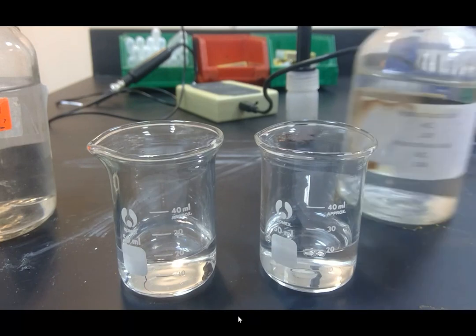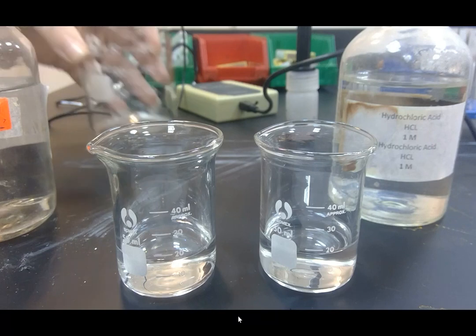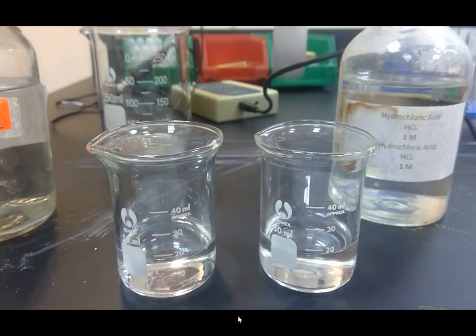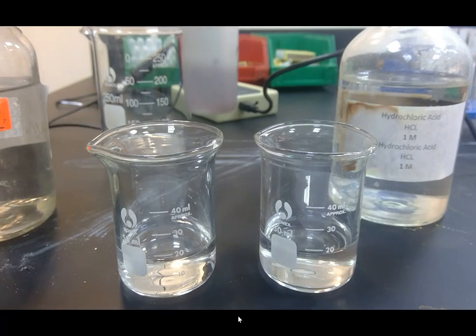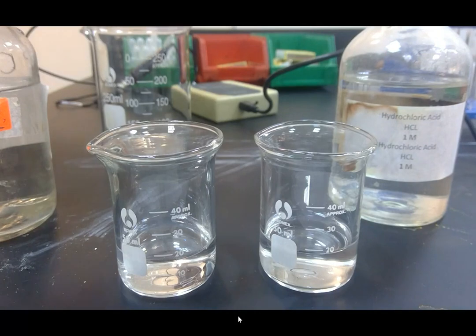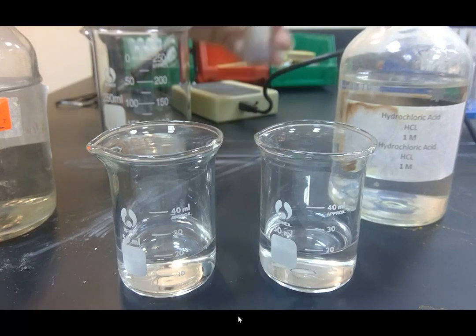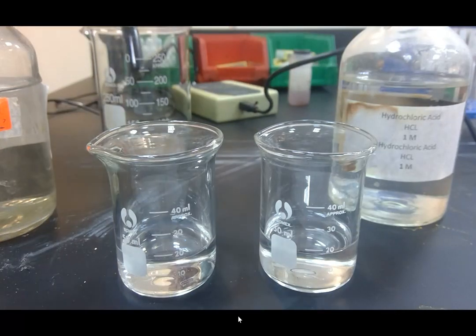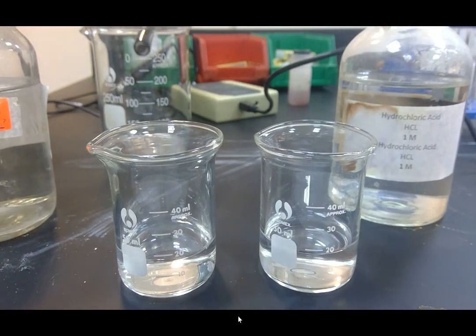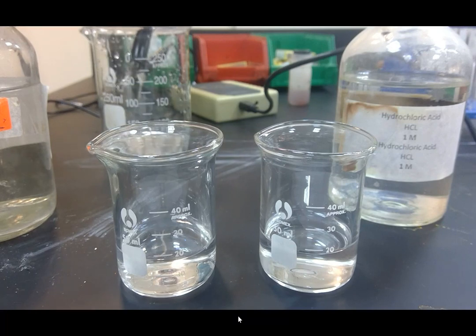And I'm going to start by measuring the pH of this solution using a pH meter. My pH meter is stored in a solution which has a pH of exactly 6 to keep it calibrated. So I'm going to remove the sensor from the solution and rinse it with distilled water to remove any of that solution which is still on the pH sensor, so that it's ready for use.